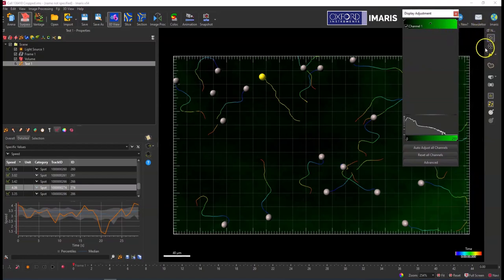Over here on the right-hand navigation panel, you want to make sure you are doing a full track selection, not just an object selection. If you have just object selection selected, it will duplicate the single spots object instead of the entire track. So you can see here that the track is highlighted in yellow along with the spots object. So the entire track and object is highlighted right now.